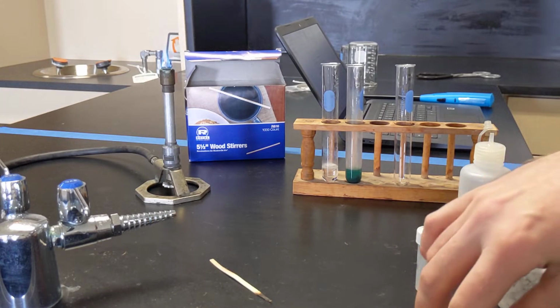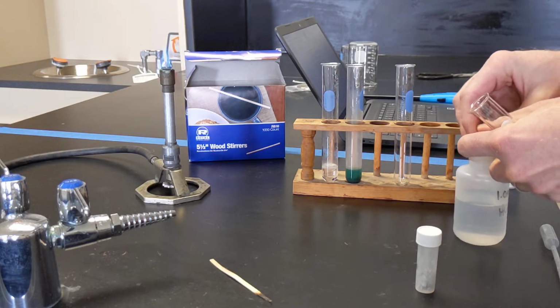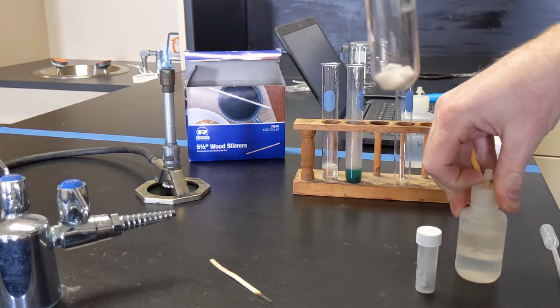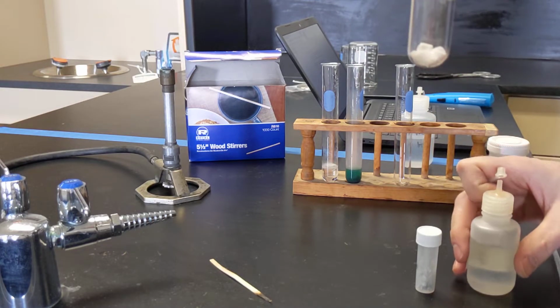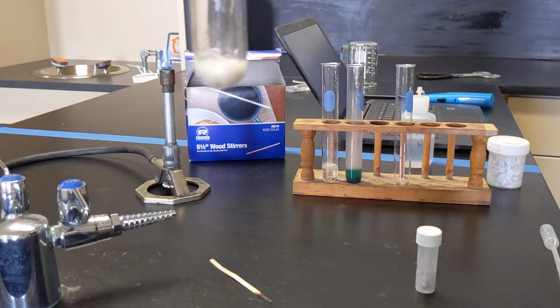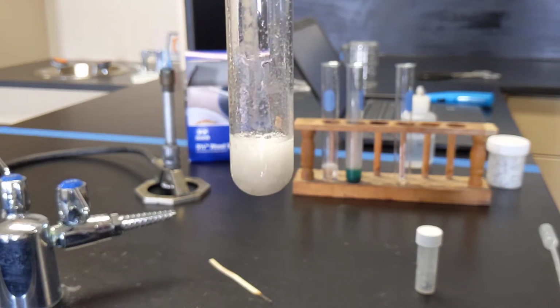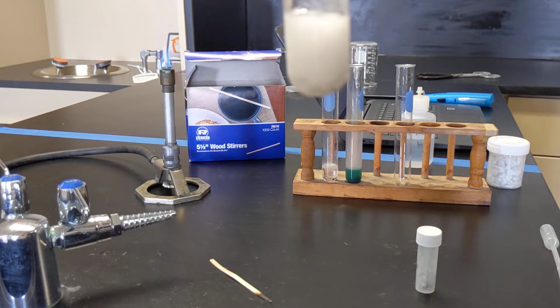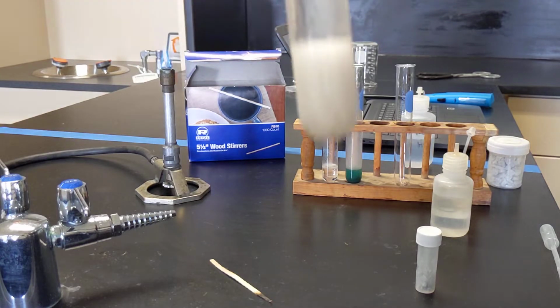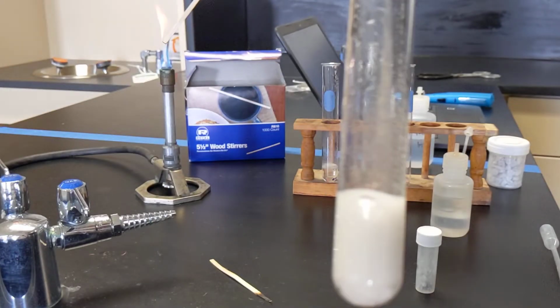And to that I'm supposed to add hydrochloric acid. I have some slightly stronger hydrochloric acid here because these marble chips can sometimes take a bit to react. So this is reaction number 4, calcium carbonate and hydrochloric acid. We will see what happens here. Then set my stick on fire.